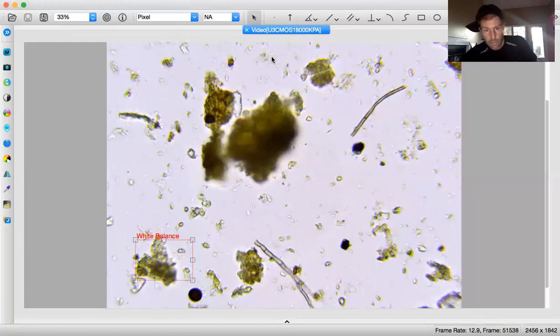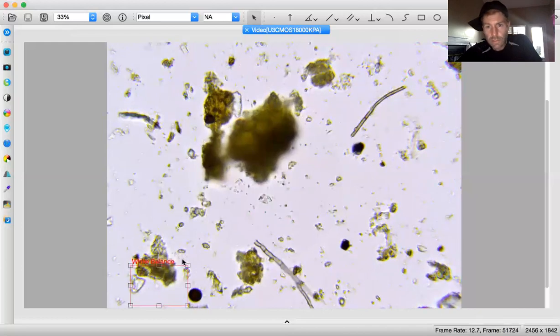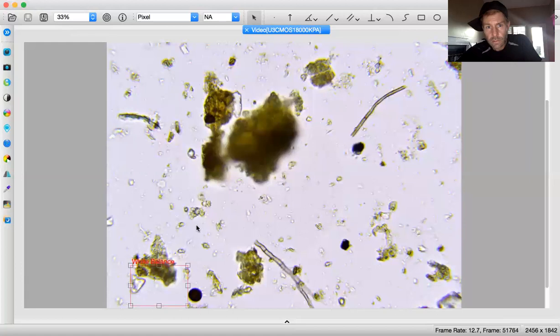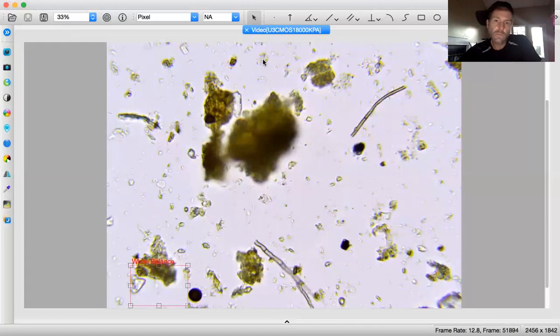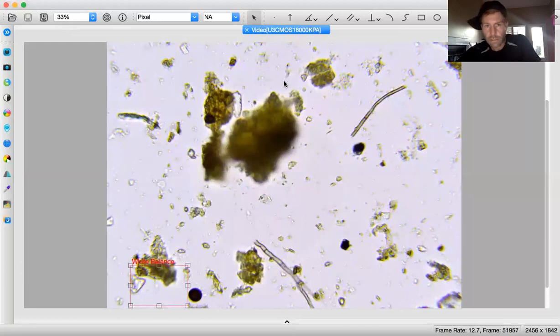All looking good here. So unless there's something behind here I'm not seeing. That could be actino, but there's a lot going on right down here I'm not so sure about. So I'm gonna go ahead and move past that. Again, that does look like a tiny amoeba. It's hard to see. I can't see an opening, so it could be a spore of some kind or an egg even. So we're gonna move on past that. We got our fungi though.